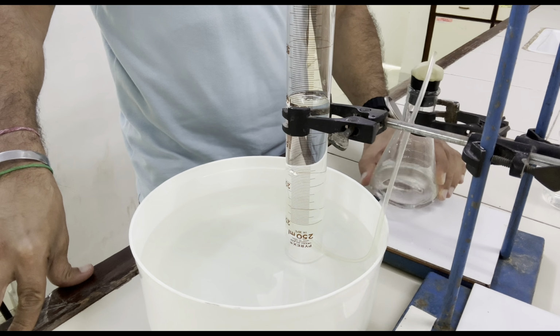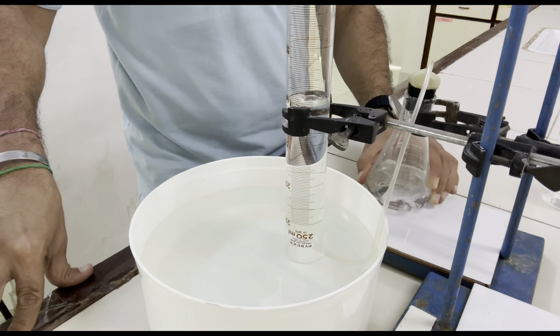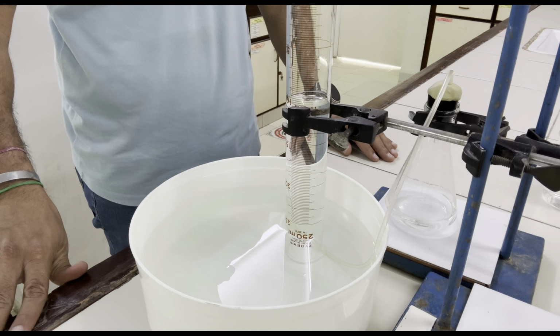Now the reaction is almost over. Let's wait for a few more seconds so the reaction gets completely over.